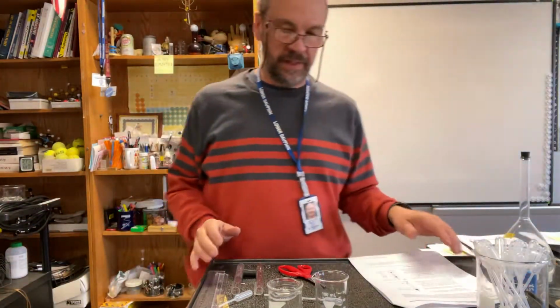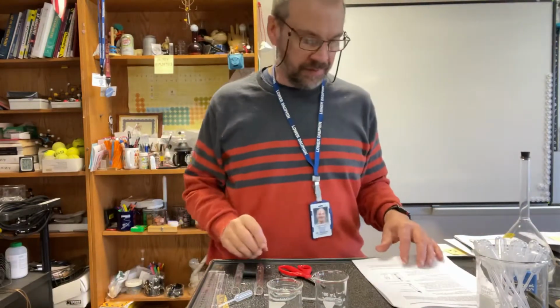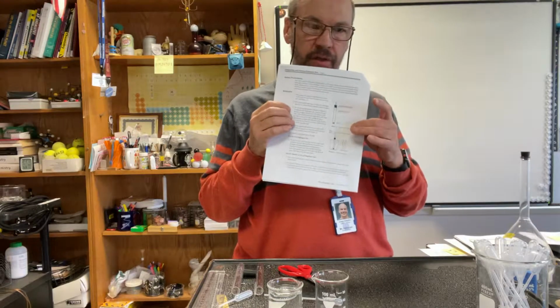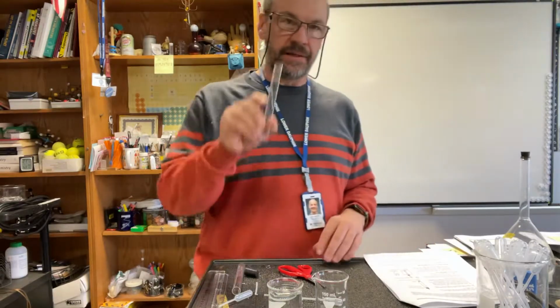All right, folks, so let me demonstrate how you are going to build this gas collection apparatus. If you look at the lab sheet, it's going to have a picture of what you're going to do, but we're going to do it slightly differently. What you're going to do is get a test tube, and Mr.